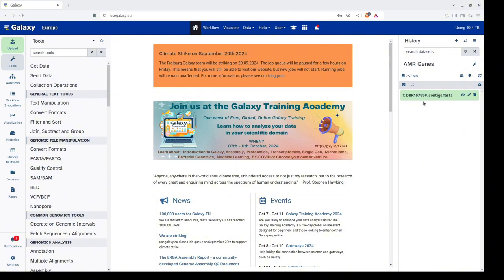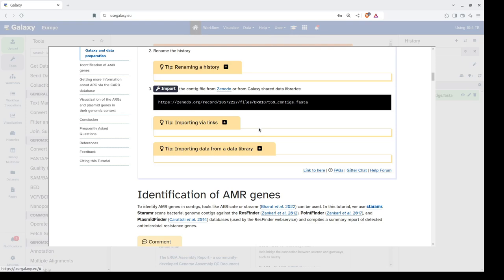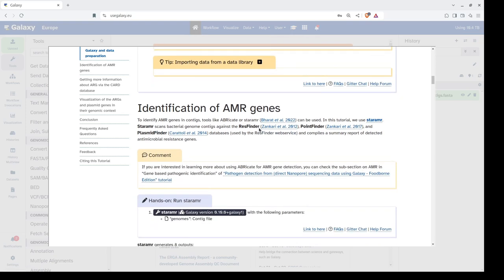The file has been successfully imported into our Galaxy history and now we will start with the downstream analysis. The first step is to identify AMR genes. To identify AMR genes in the contig file, there are several tools such as ABRicate or StarAMR. In this tutorial, we will specifically use StarAMR, which scans bacterial genome contigs against the ResFinder database, PointFinder database, and PlasmidFinder database, and reports a detailed summary of detected antimicrobial resistant genes.